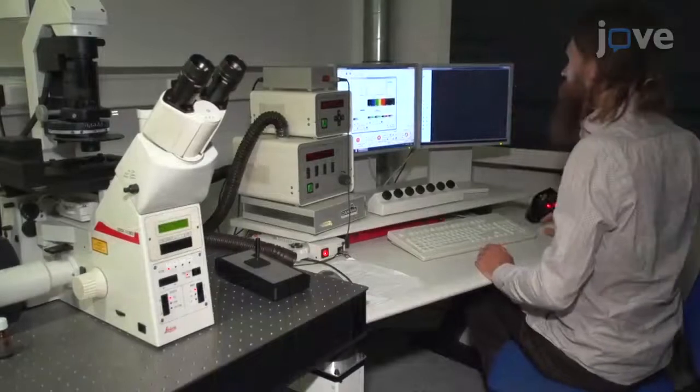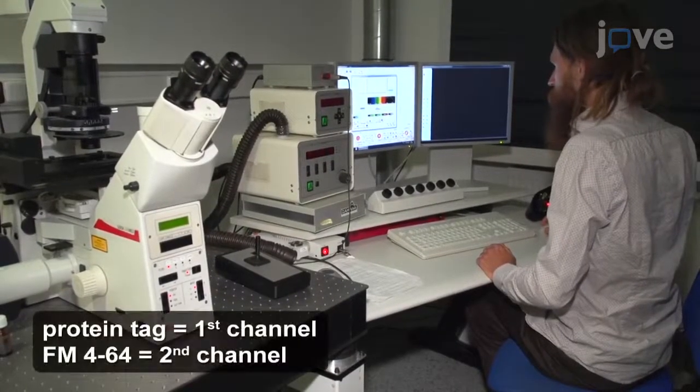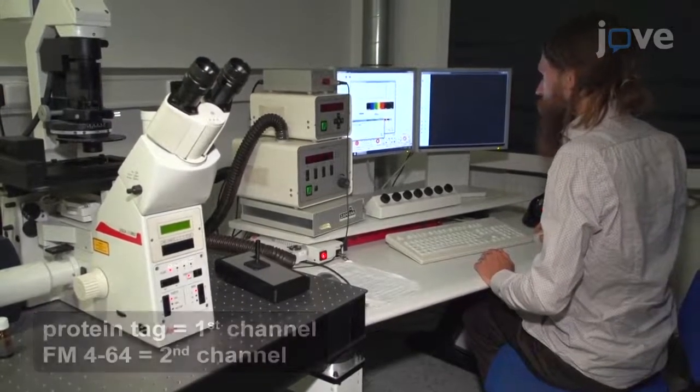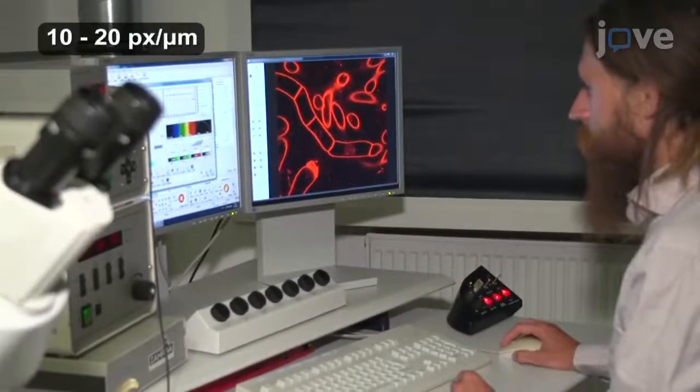To capture one equatorial confocal section per one cell, set a sequential two-channel scanning for the chromophore used as the protein tag and for FM464. Also set a higher optical resolution.